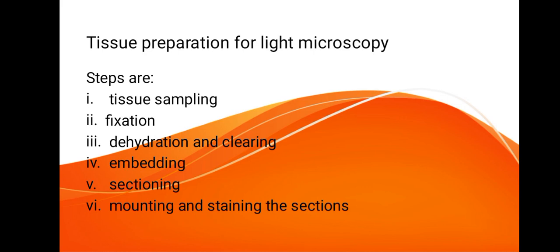In this session, you're going to learn about tissue preparation for light microscopy, and this is specifically in histology. We're going to begin with a brief introduction.